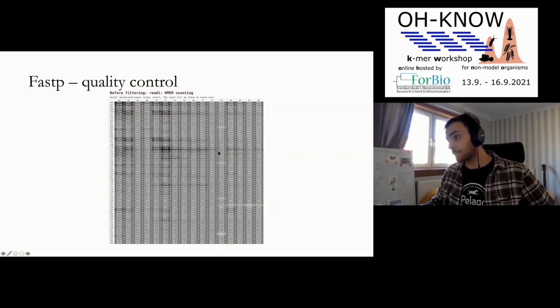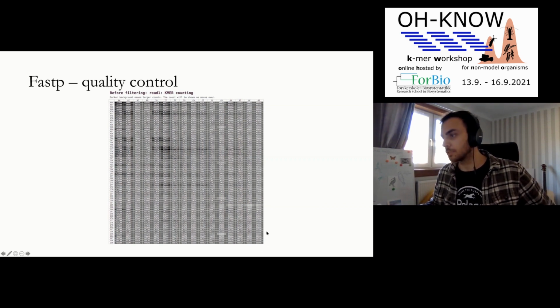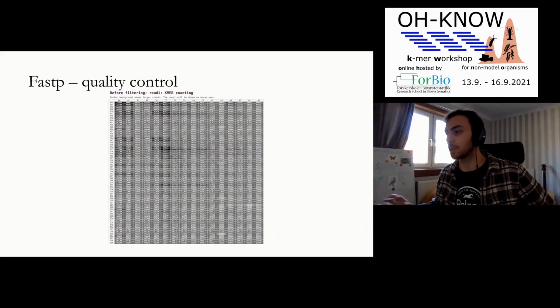And again, if you have this poly-G issue, this lower corner here typically is completely black, which is really easy to tell. It produces one of these for pre-filtering and also post-filtering. So if it is a problem, you should be able to see how well you've been able to fix that problem during the filtering as well. So I think that's just a bit of a whistle-stop tour of what we're going to go through.